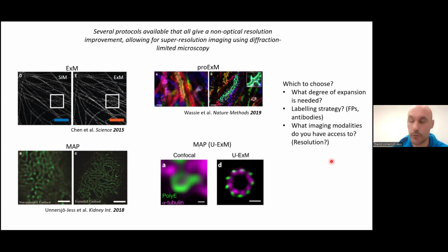And then one other thing to consider here is that you are almost always dealing with water embedding. So, for instance, if you want to use a very high NA objective, like an oil objective, you will have a pretty severe mismatch in refractive index, and this can be an issue. So this is also something to consider.